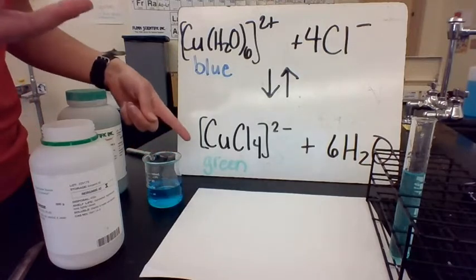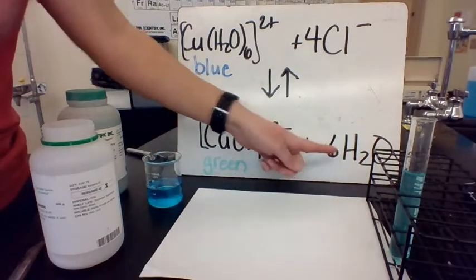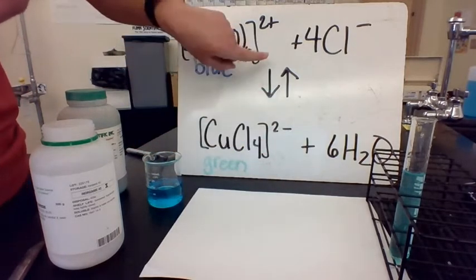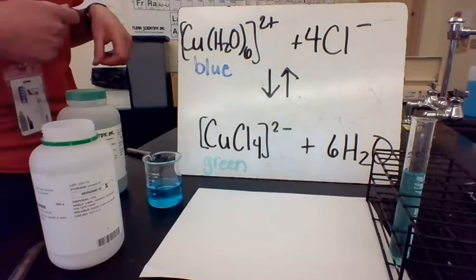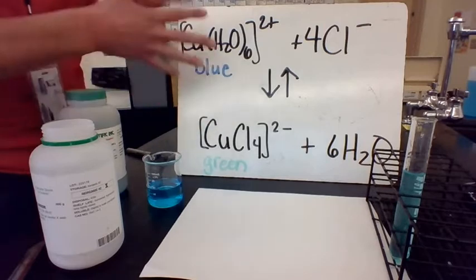And then we were able to make the reverse happen by adding water. So we added water, the reaction proceeded this way and formed this blue original reactants again. So we can see that reactions are reversible.